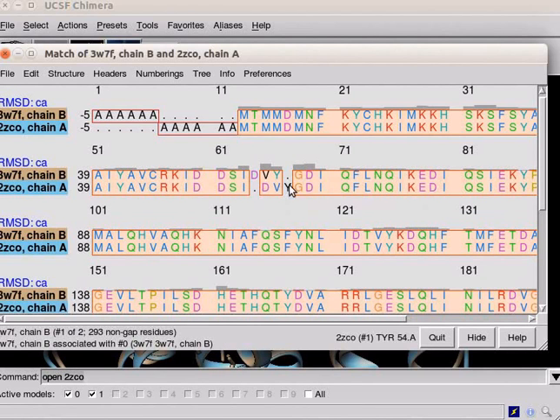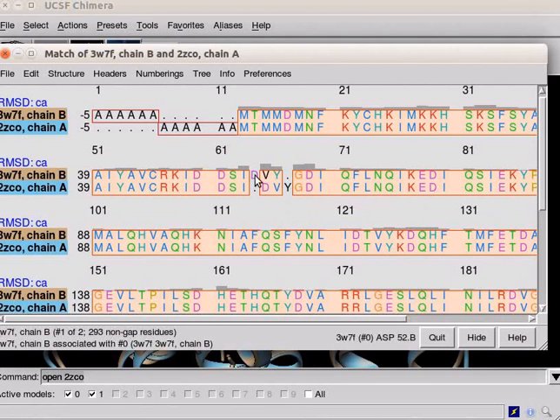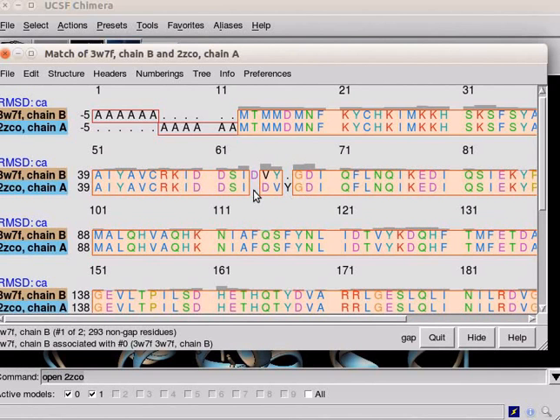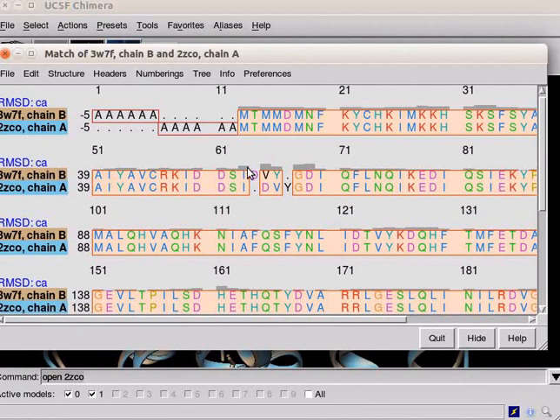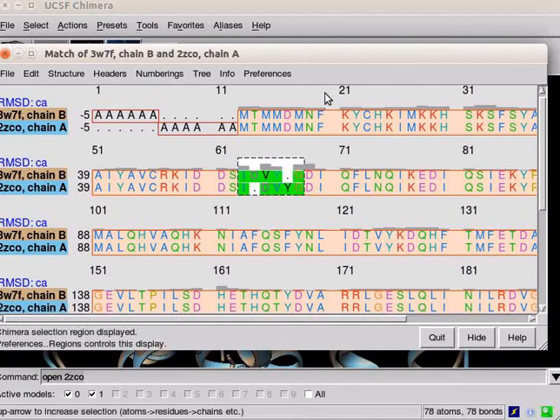Place the cursor over the corresponding one-letter code. The residues from 52 to 54 are shifted due to the presence of gaps in the sequence. Select this part using the cursor.